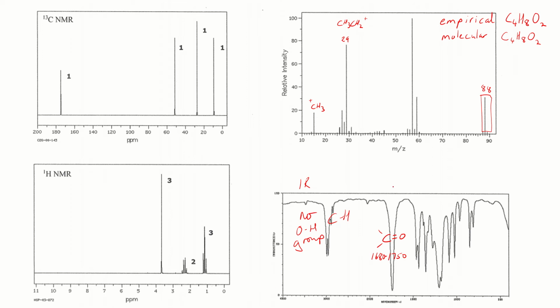Now the second oxygen, what it could be is maybe CO. But the annoying thing for that is that's down in the fingerprint region, 1000 to 1300. Could be any of these. Got no real idea down that area. But you can make a mention with a question mark, and we'll see later if it is present.